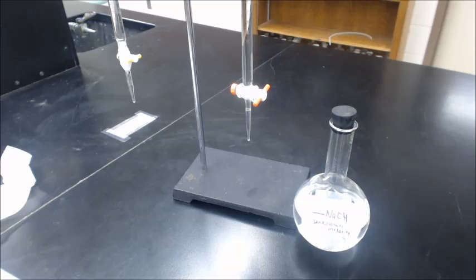In experiment number 24, you're going to do a titration. In fact, you're going to do a couple titrations.